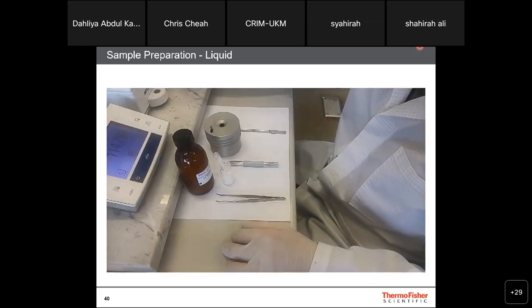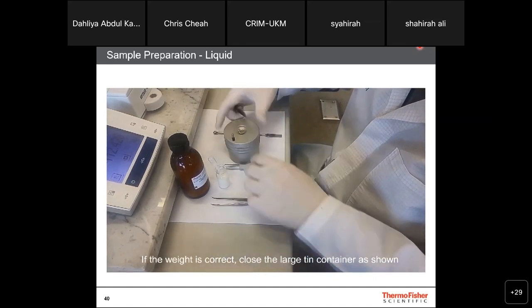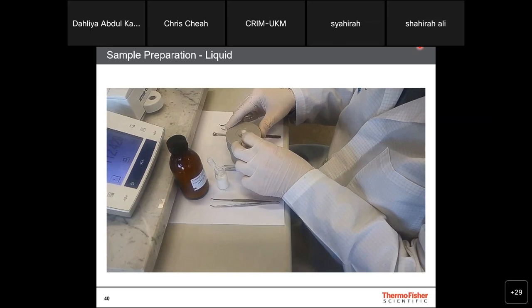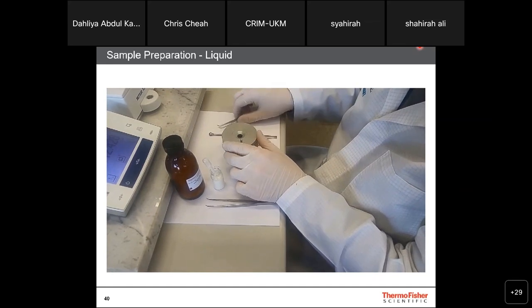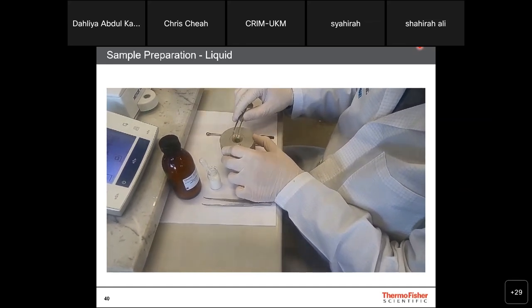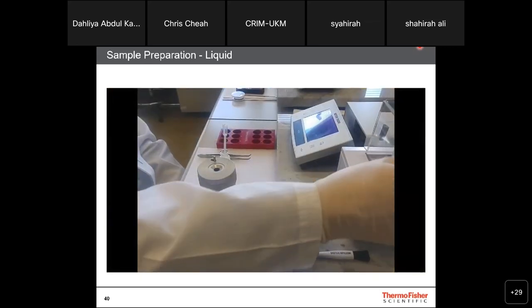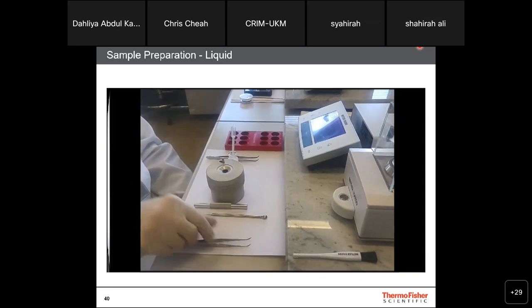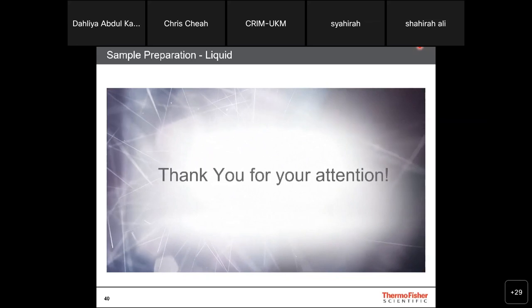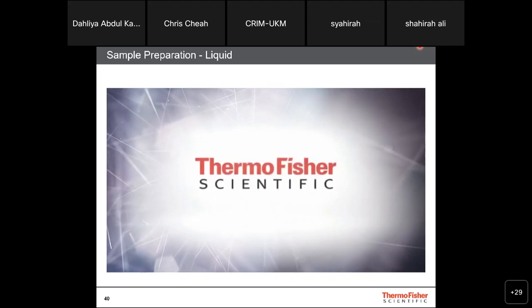And the way we close the capsule will be slightly different. So right now we will actually seal it better. Instead of like the solid sample earlier, where we just fold it multiple times, right now this is like a disc. And we will record the value. So the capsule, once prepared, will go on top of the auto sampler. Okay.